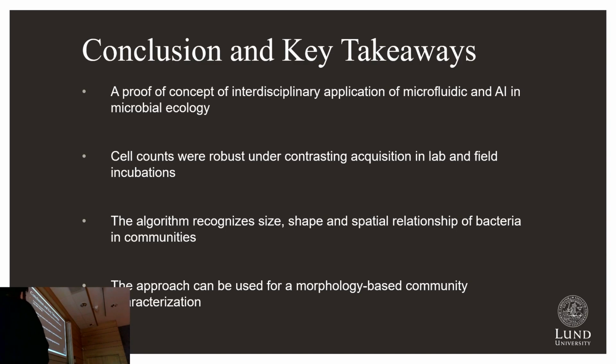So the key point I want to show here is that we are the end user, and we want to show people that in soil microbial ecology, it's not very common yet. People are moving forward to adopt this newer technology, and we want to show them that by combining soil chips and our deep learning, we can get more information.